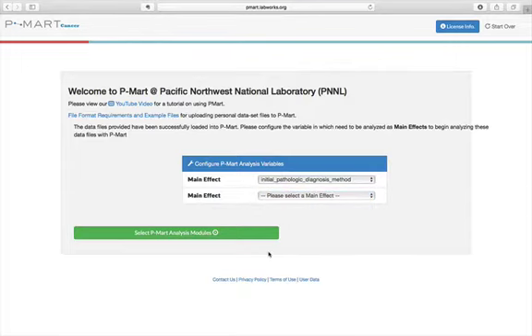The next step is to select the analysis modules. More information on this and navigating through PMART can be found in the PMART Cancer Introduction video on our YouTube channel.